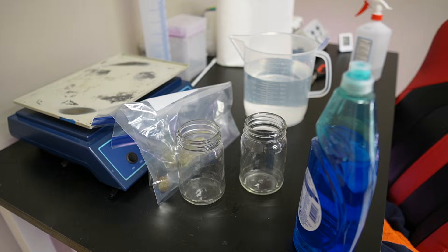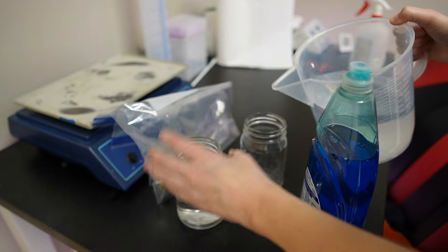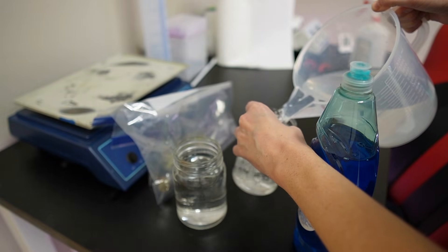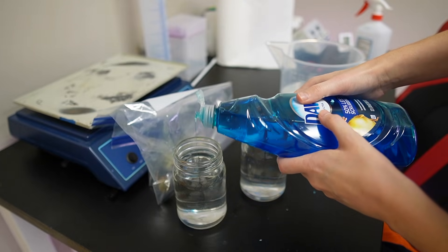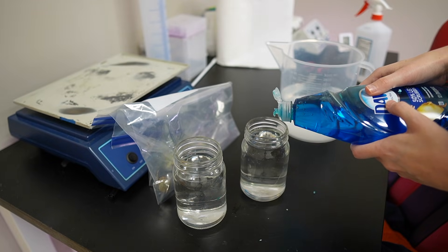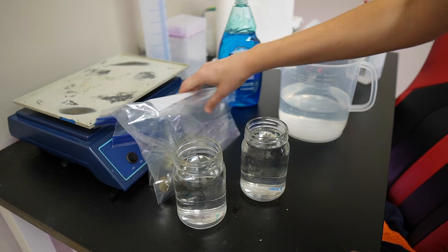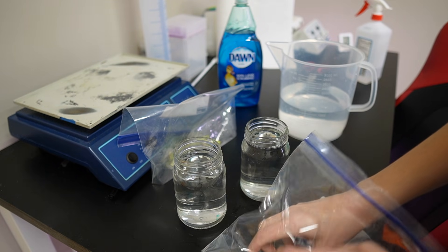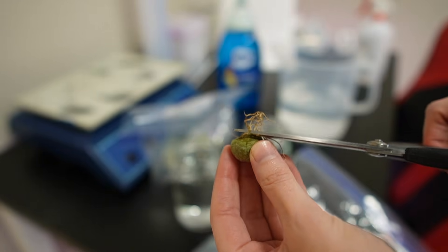Now we're going to go put our Monstera Aurea nodes and the pseudolithos into tissue culture. First things first, I'm going to wash our explants in just some soapy water. You don't need a lot of dish soap, just a drop — you can also use Tween 20 instead of dish soap if you want to. And just to make it easier I'm going to cut off the roots before we even really start.